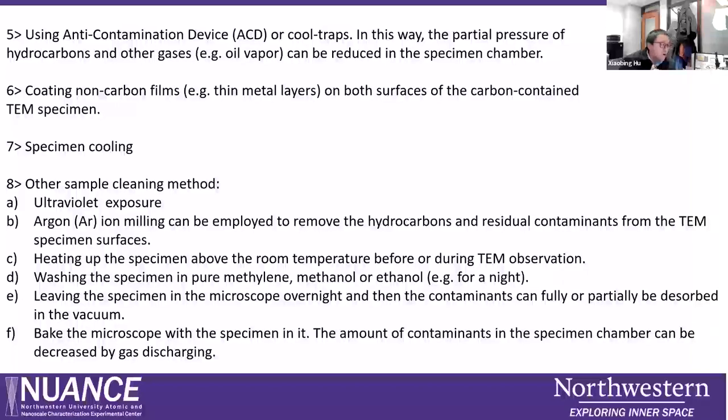And you can also try washing your sample in pure methylene chloride, methanol, or ethanol. You can also leave your sample in your microscope overnight and keep it in high vacuum for a long time. Maybe the contaminants can be fully or partially desorbed in a high vacuum condition. And also, you can bake your sample, bake your column, bake your microscope, as I mentioned to you. So there are many ways to remove contamination.